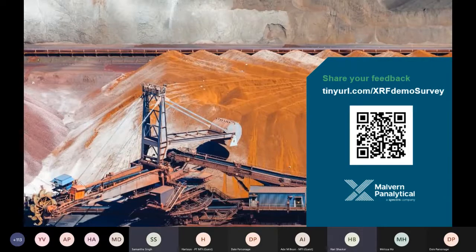Okay, thank you. Can we do liquid samples in the Zetium? Yes, yes, definitely, yes. We can do liquid samples, even loose powders. The only thing required for that is to have the liquid sample flushing attachment. So the standard Zetium works under a vacuum atmosphere inside. So you just have to change over to a helium atmosphere, and that's an accessory that can be purchased with the instrument or even a bit later. Yes, you can do liquids.